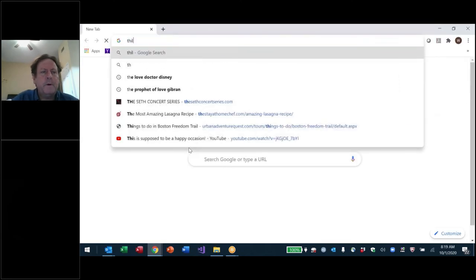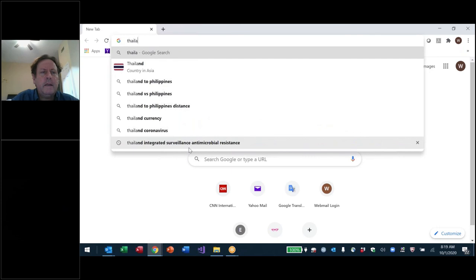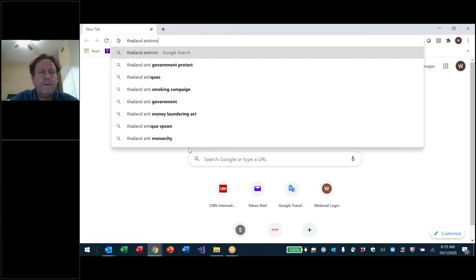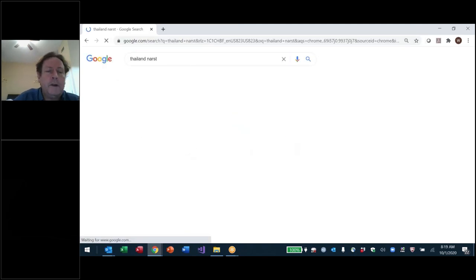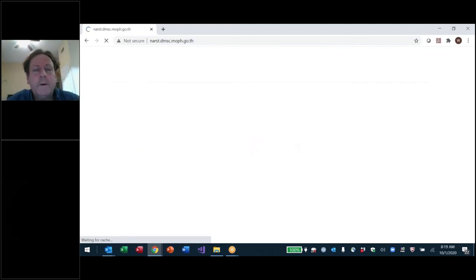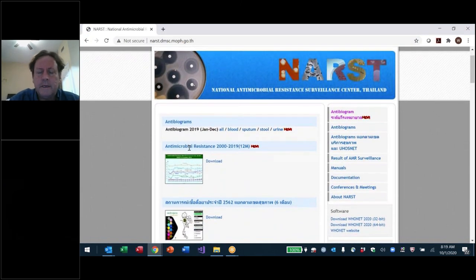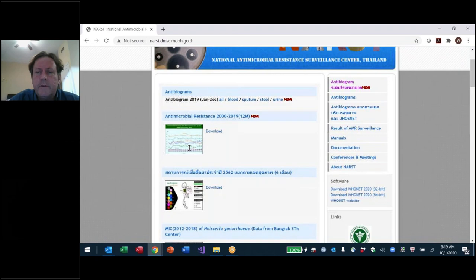So while that's coming up, I'm going to go to Thailand, and I'm going to look for NARST. Well, I know what NARST is. Let me see if I can find it. Thailand, NARST. NARST is the National Antimicrobial Resistance Surveillance Center of Thailand. So here you can see their reports.